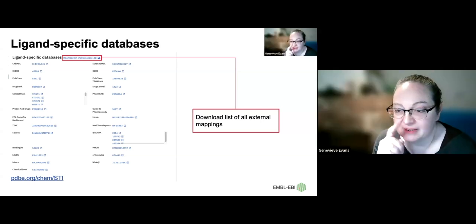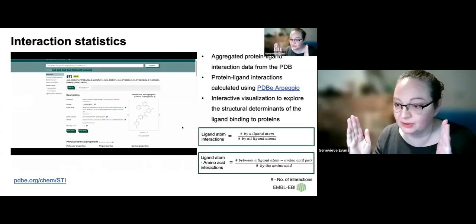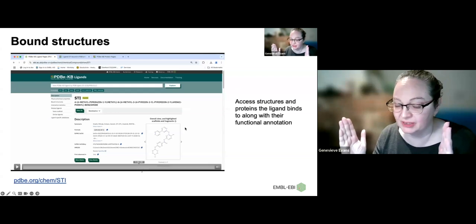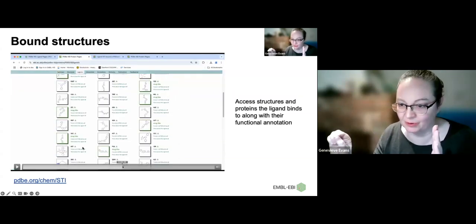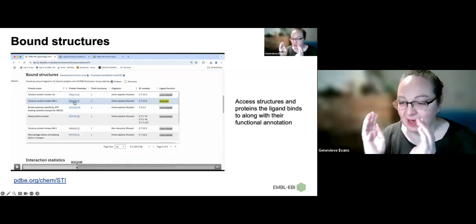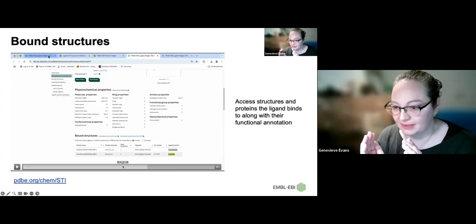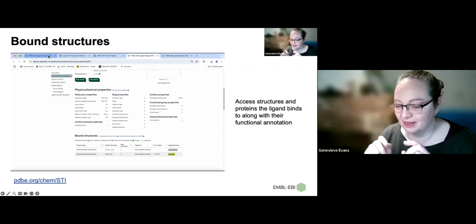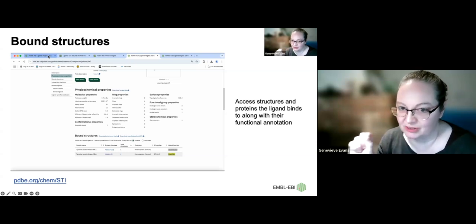Just to add to that, from the ligand pages, as Roshan showed, there's this table of the proteins and structures that's central within the ligand page. There are links that will take you to individual entry pages, and I think it lands specifically on the interaction part of that page, which focuses on the ligand, where it's positioned within the structure, and what interactions are occurring. You can flip between the two options, the two radio buttons, protein and structure.